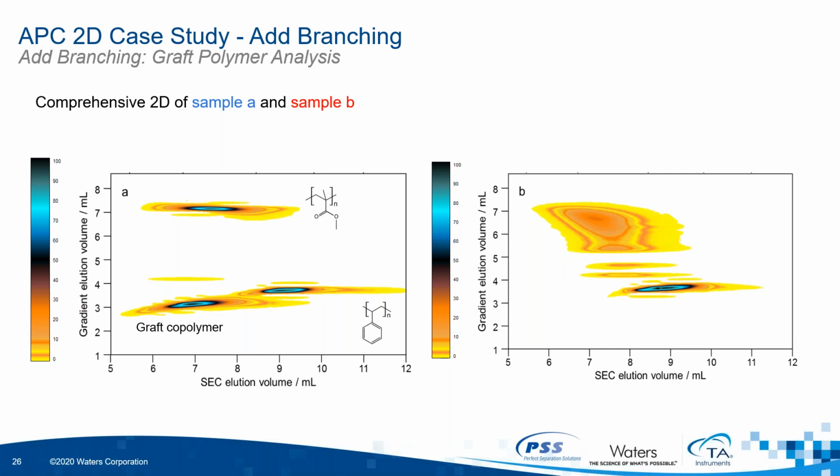By looking at the overall results of sample A, it is apparent that the synthesis strategy is different to that of sample B. Although the individual one-dimensional traces of both samples were similar, the 2D result of sample B differs greatly from that of sample A. In the top half of the right chromatogram, there is a large fraction of graft polymer with different grafting densities. In between, there are some mixed fractions. Just like with sample A, there is also a fraction of unreacted side chains present.